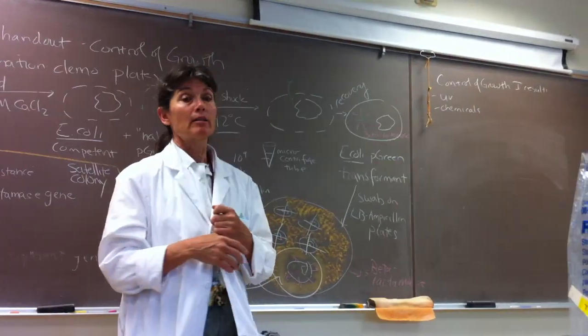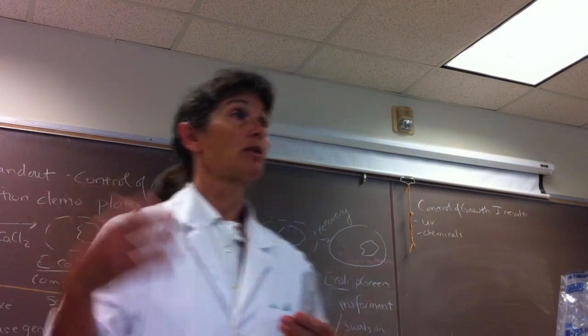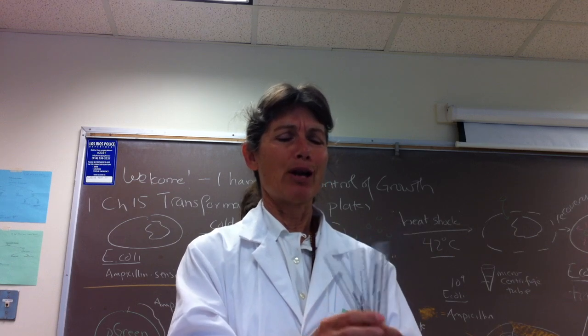And then the second thing we're going to do, and this is going to take some teamwork, you guys, but the sooner you can do this, then the sooner we can move on to the last part of today's experiment, and the sooner you can go to lunch. And I know you're all looking like you could use some lunch or coffee or both, okay?